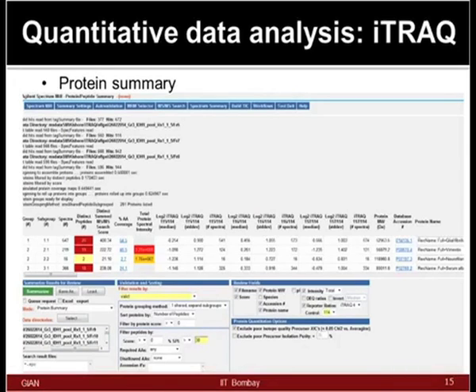At the end, from doing this, you will generate the protein summary data. Although these things may not be so clear to you to read, what it generates is, from the various spectra which have come from each of these samples, you will see how many peptide sequences you are able to derive. Those in red mean good hits. For instance, the ones in red are 28, 19 and 18 peptides. It means, as you can understand, these are much more confident hits.